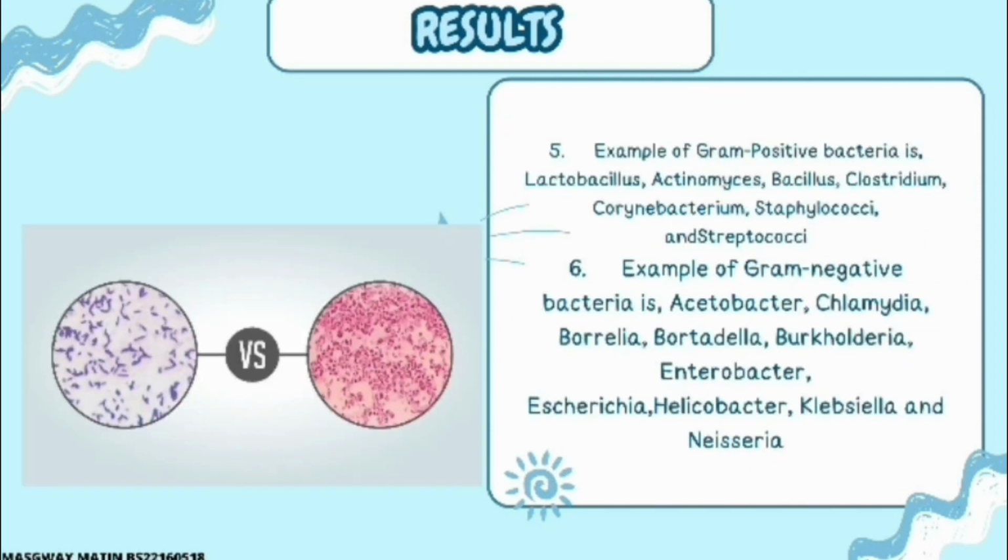Examples of gram-positive bacteria are Lactobacillus, Actinomyces, Bacillus, Clostridium, Corynebacterium, Staphylococcus, and Streptococci. Examples of gram-negative bacteria are Acetobacter, Chlamydia, Borrelia, Bordetella, Burkholderia, Enterobacter, Escherichia, Helicobacter, Klebsiella, and Neisseria.